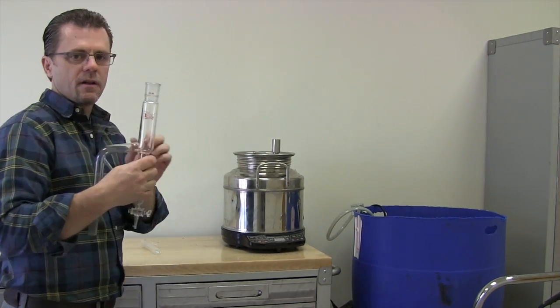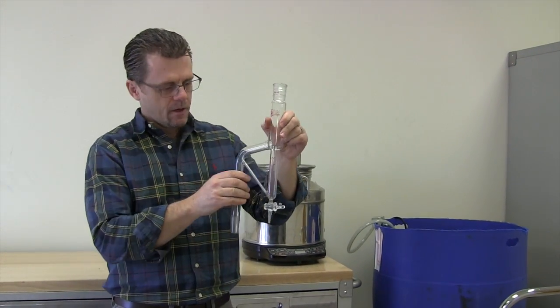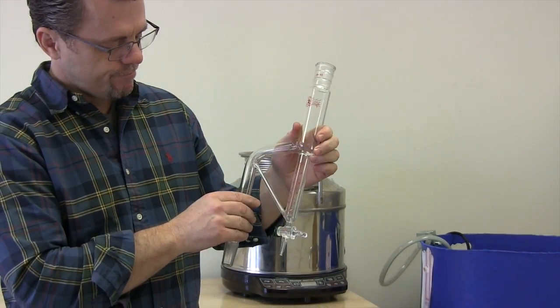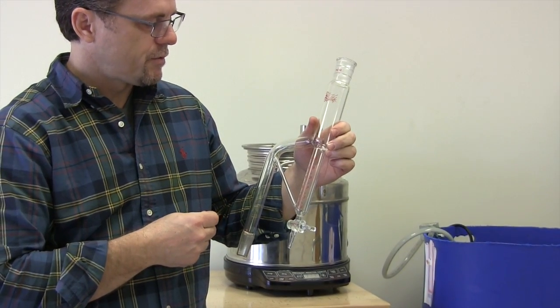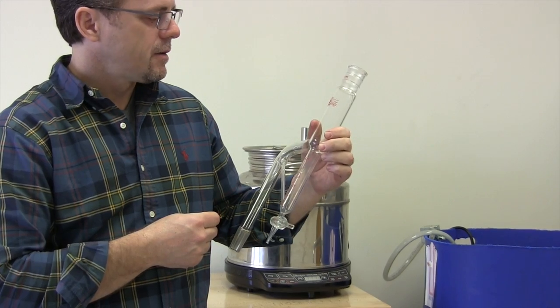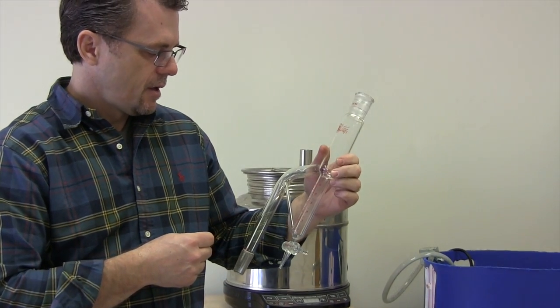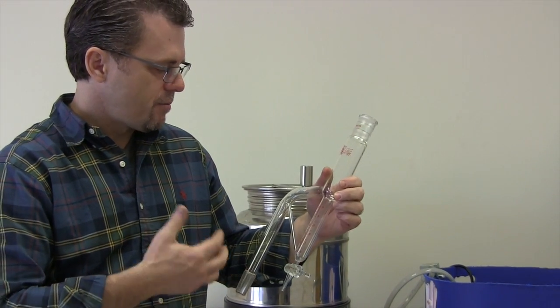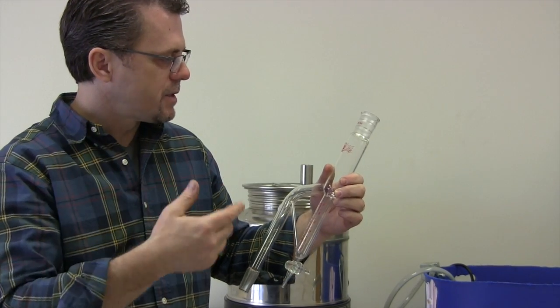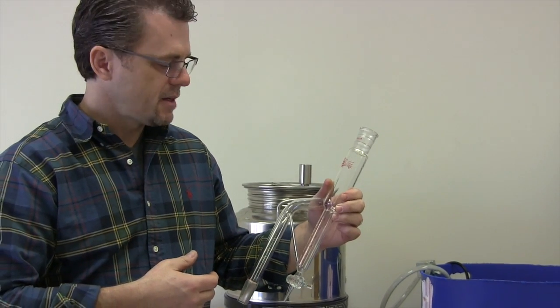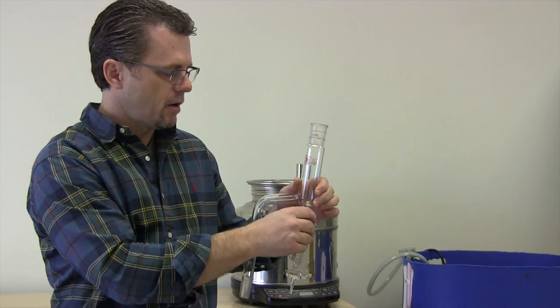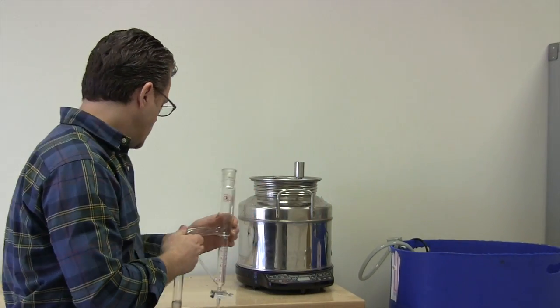This is our Clevenger, which is an old device used for small-scale hydro distillations. It works very nicely. I've modified it a little bit over what's available from stock glass houses to make this bigger and have a bigger condenser.